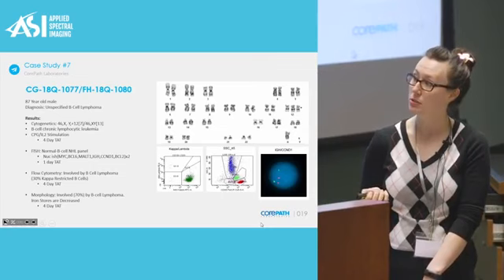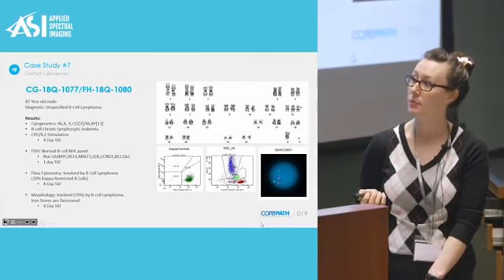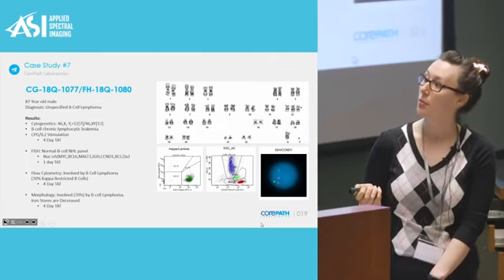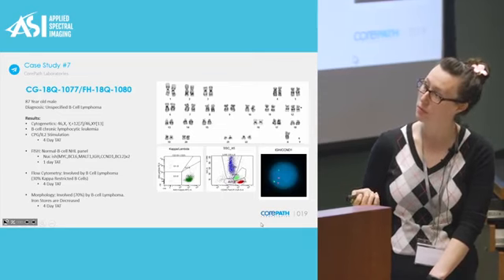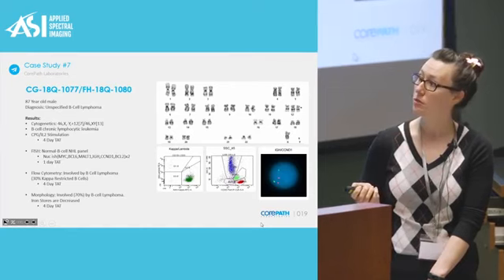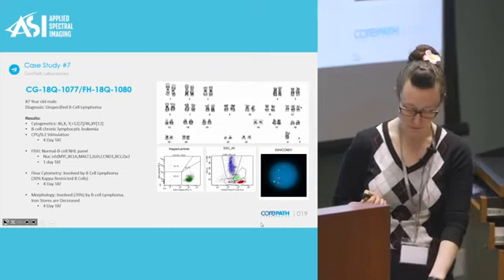Our flow cytometry indicated that it was involved by B-cell lymphoma with 30% kappa-restricted B cells with a 4-day turnaround time. And these are the scatter plots for this patient. And then morphology also showed 70% B-cell lymphoma, and the iron stores were decreased with a 4-day turnaround time.